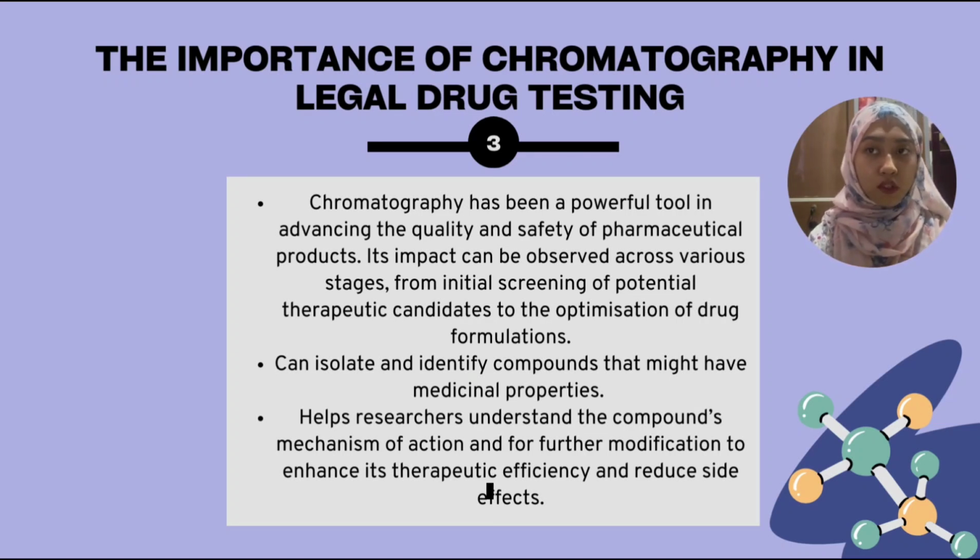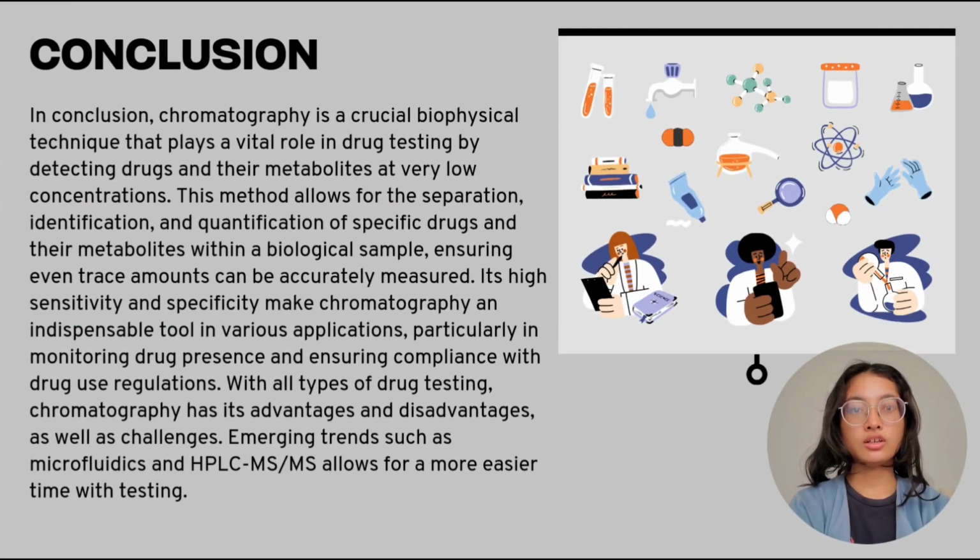Once a potential drug candidate is identified, chromatography is used in conjunction with other techniques like mass spectrometry to clarify its structure. This helps researchers understand the compound's mechanism of action and guide further modification to enhance its therapeutic efficacy and reduce side effects.